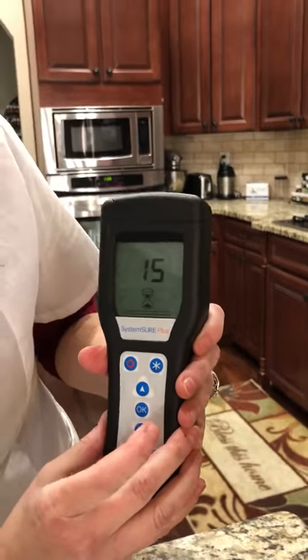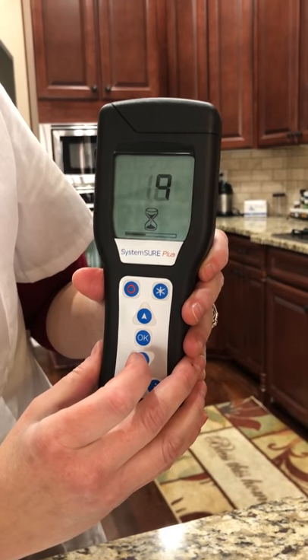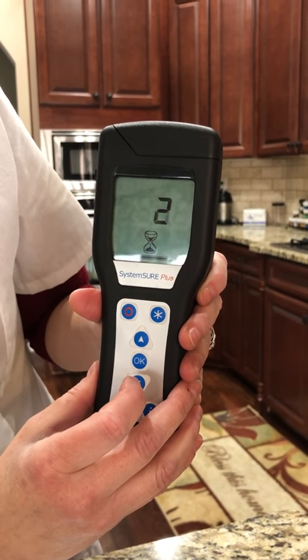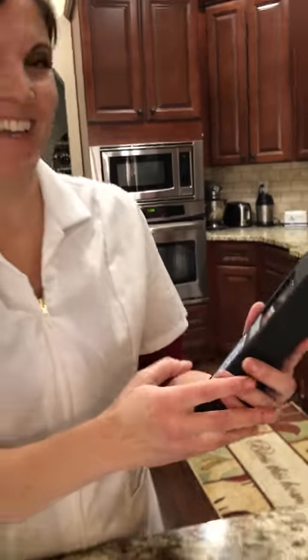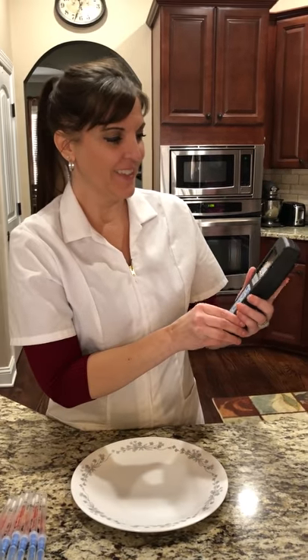We have our ready-to-read. It takes 15 seconds to read the result. So the plate is starting out at 35. That is the reading of the plate in its clean state, and that is not acceptable. You want it to be 10 and under for the strictest standards of what is clean and disinfected. And anything over — 31 and above is a fail completely.